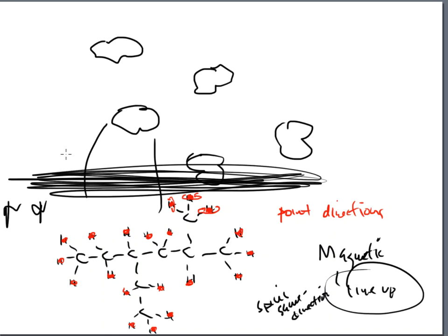Their feet won't. So if they can sit on a swing and not really have to put any work involved and just sit there, they're lazy. That's what they want to do. And that's what these nuclei are doing as well. They're just sitting there. We've put them all onto a swing. We've put them all facing in the same direction on the playground, but they're not really doing anything. They can just sit there and wait. And those are perfectly fine for those nuclei to do that.